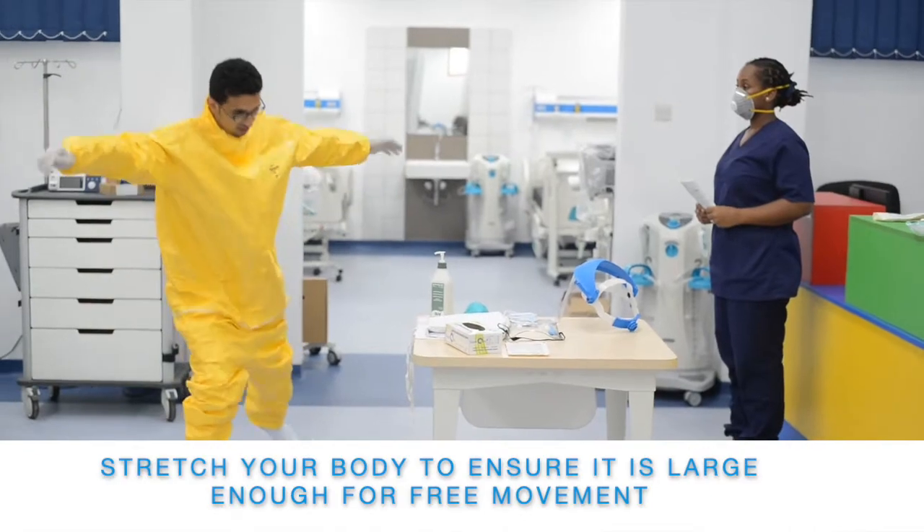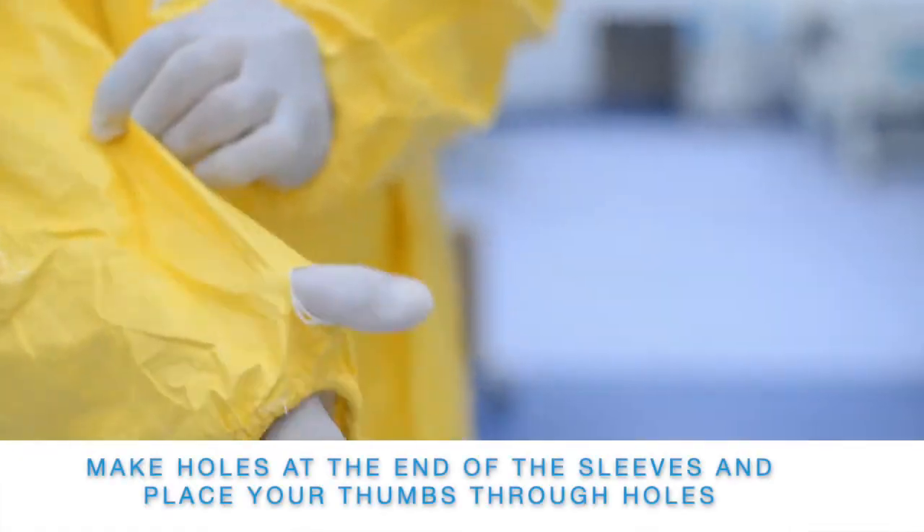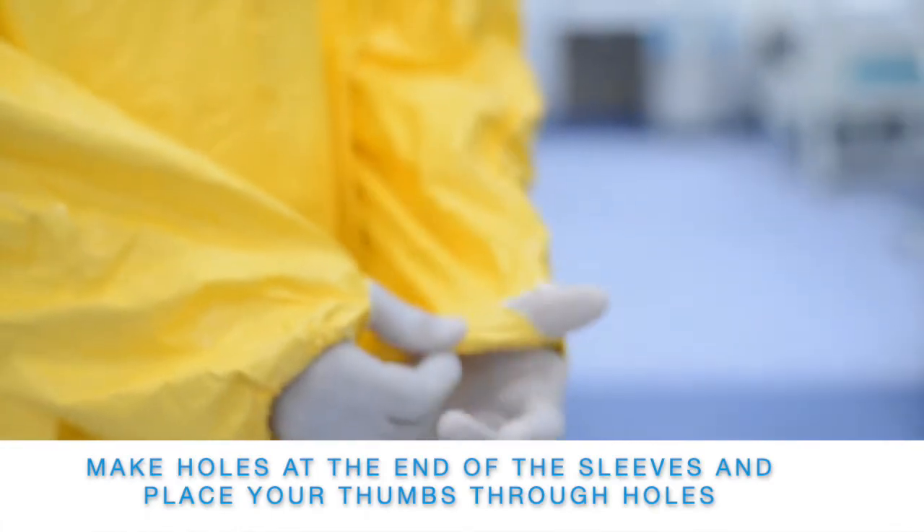Stretch your body to ensure the coverall is large enough for free movement. Make holes at the end of the sleeves and place your thumbs through the holes.